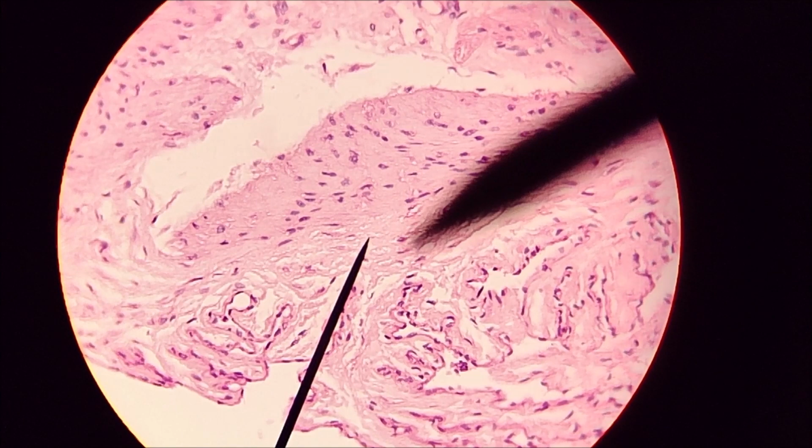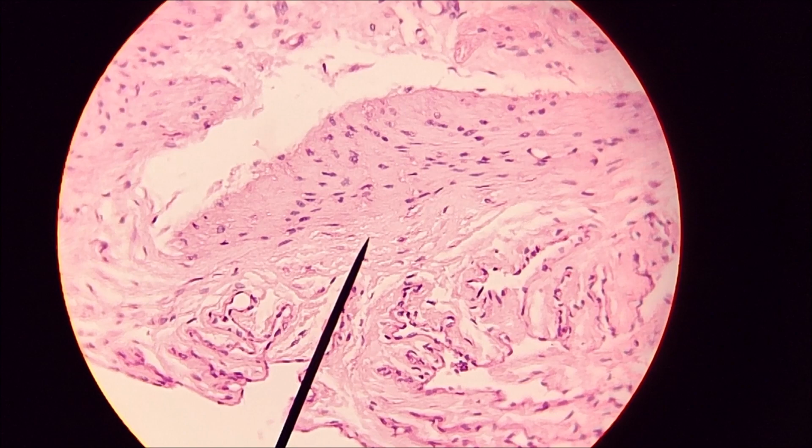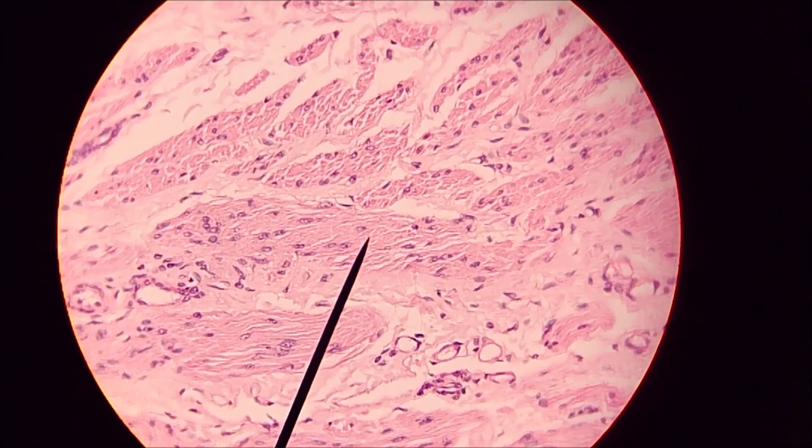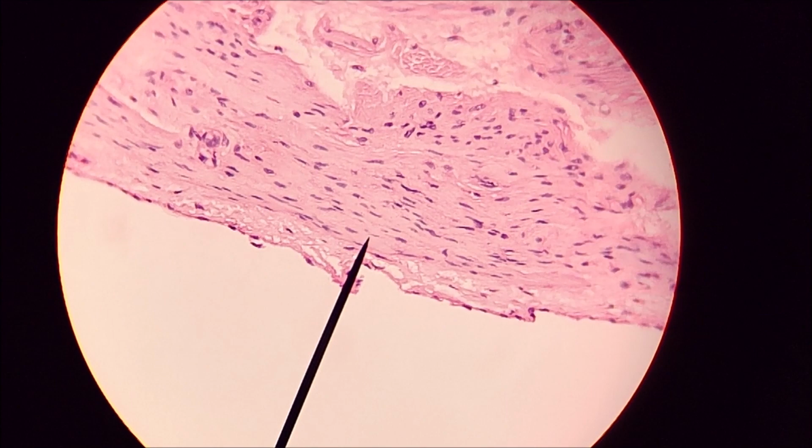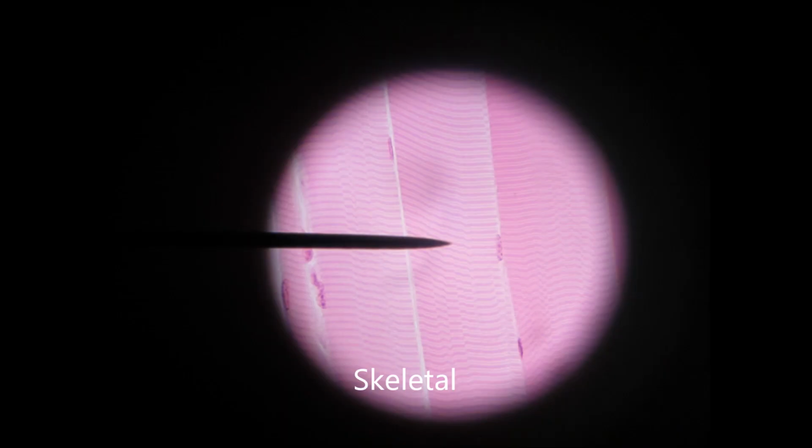This is classic smooth muscle. All right? Doesn't look anything like the other ones. Kind of a flow through there. Oh, here we go. Yeah, that looks good. So it's going to come down through here. That's classic smooth muscle. It's not one that's easily identified if you don't really know what you're dealing with. But when you see it on the outside like this, of like a bladder, for instance, this is classic smooth muscle.